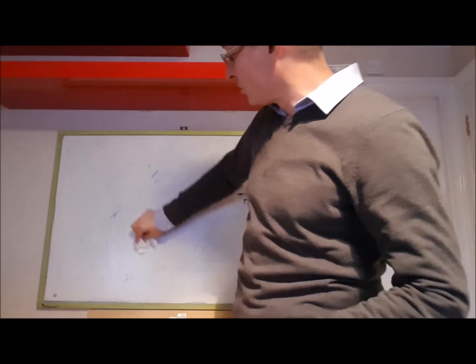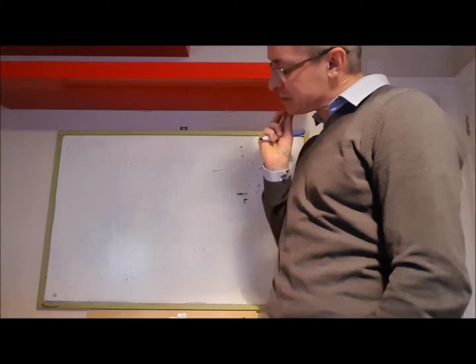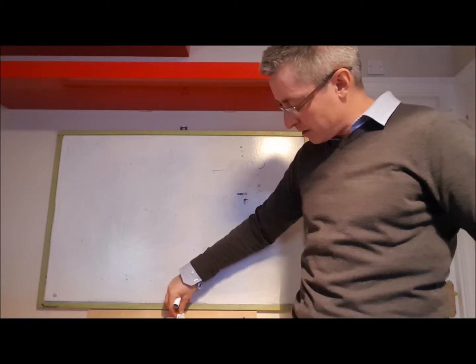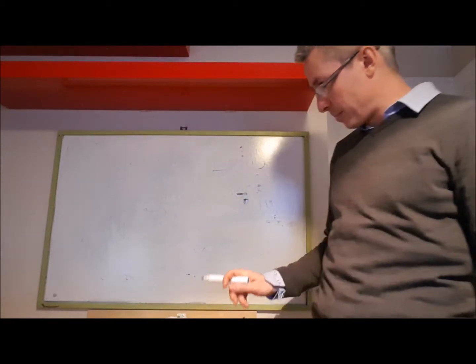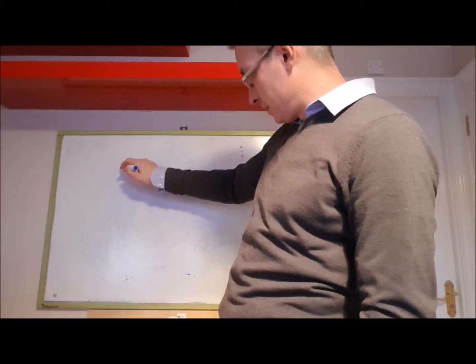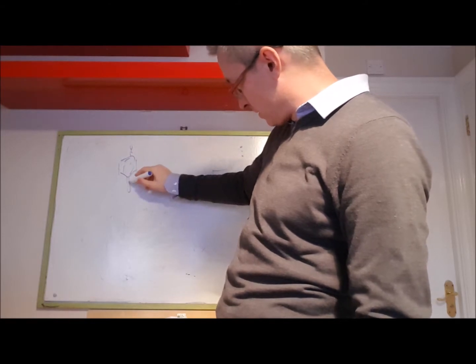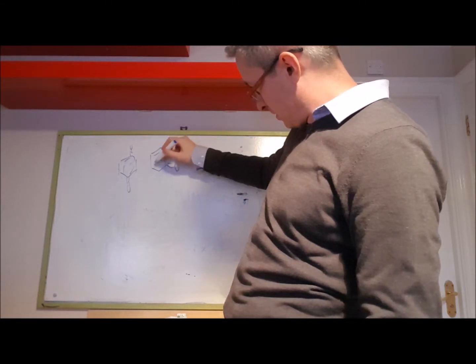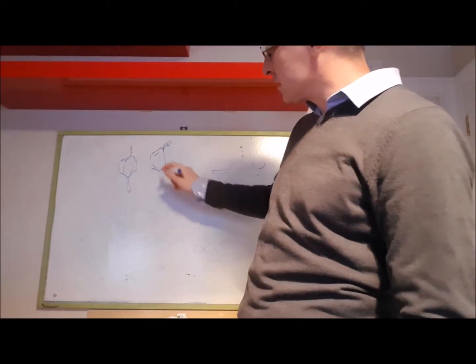I want to get specifically now onto maybe measuring the pH of oils. On this one, I think my first attempt would be to use a carbon electrode. Maybe this one here. Now, this is speculation a little bit, but I'm thinking about a carbon electrode. In the carbon, it can have functionality like this quinone or this orthoquinone.